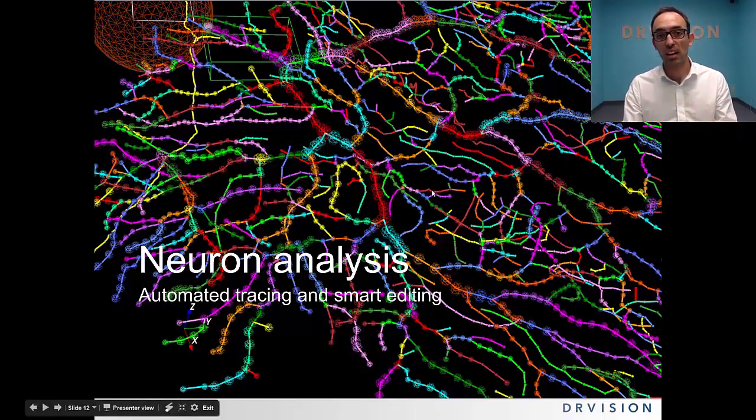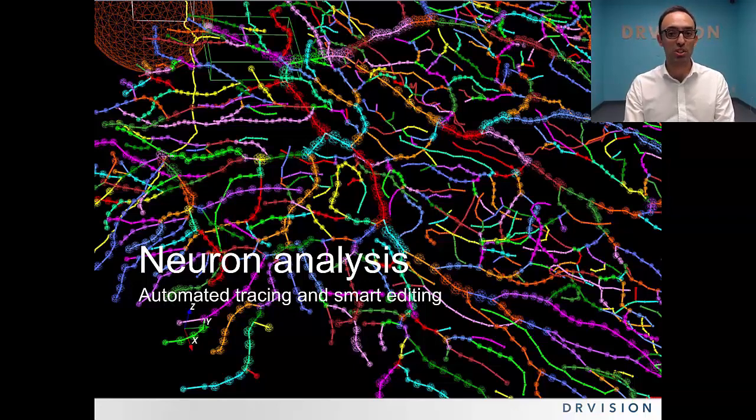It's mostly the what. And we did that in this way because there is already a lot to talk about, and we don't want to keep you too long. So today's scope is mostly about what we do.